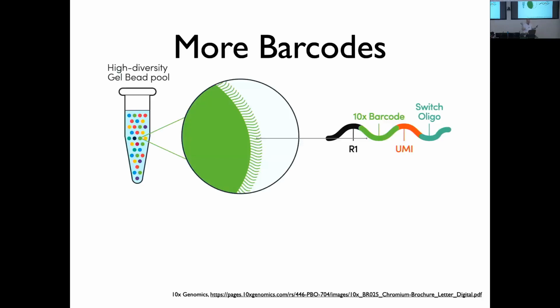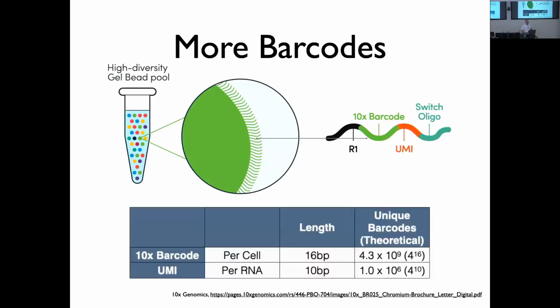I mean, it's going to be A's, T's, C's, and G's, right? But just like we demultiplexed to samples before, we're going to demultiplex to cells and to some extent to UMIs. The reason you don't necessarily need that many UMIs is because it's the combination of cell barcode, UMI, and gene. So if you see 2 identical UMIs, but one's attached to a read from glucose 6-phosphate dehydrogenase, and another one's attached to a read from, I don't know, the insulin gene, those can't be the same because they're different genes. They came from different places in the genome.